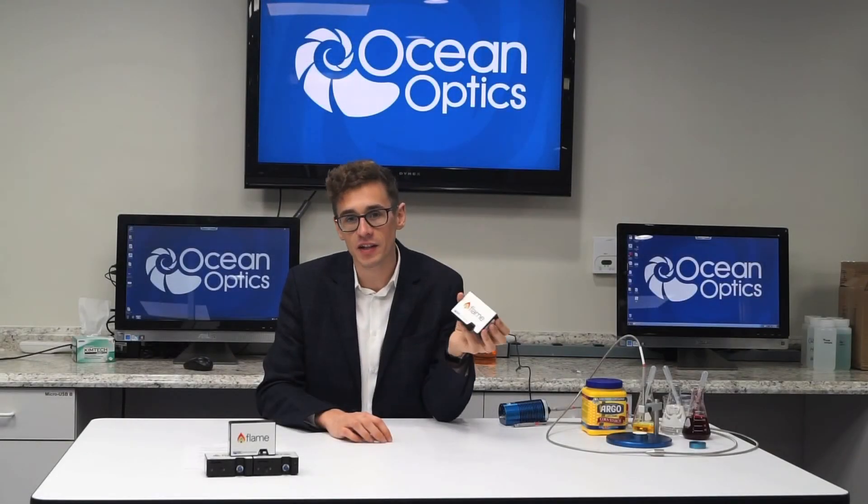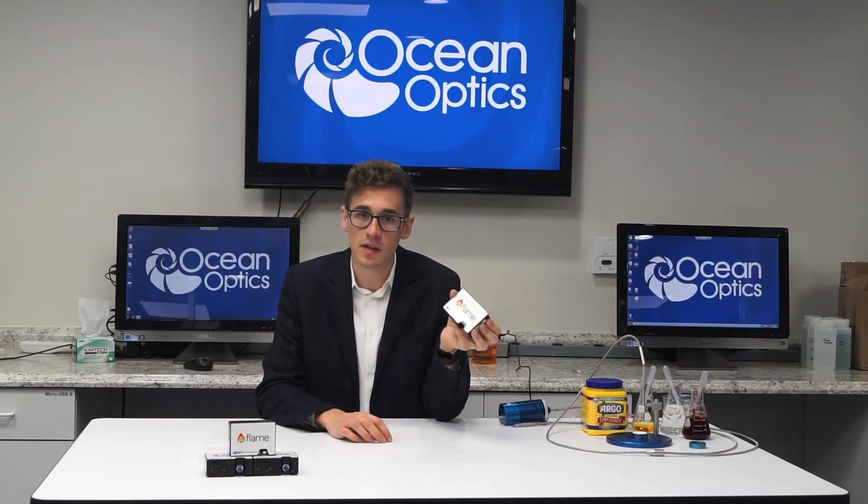At OceanOptics, we are passionate about taking the measurement to the sample and enabling NIR spectroscopy to be used in new and exciting ways in a wider range of places than ever before.